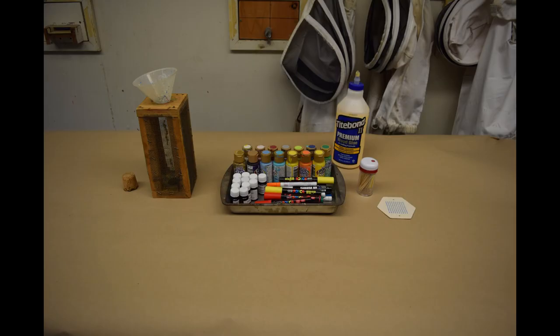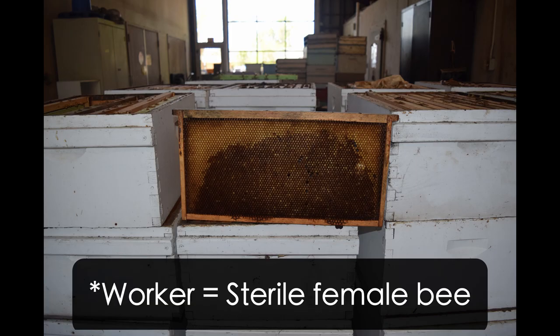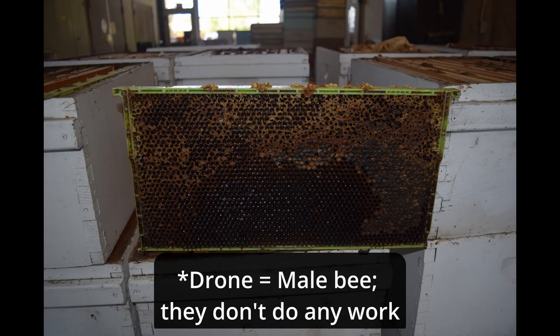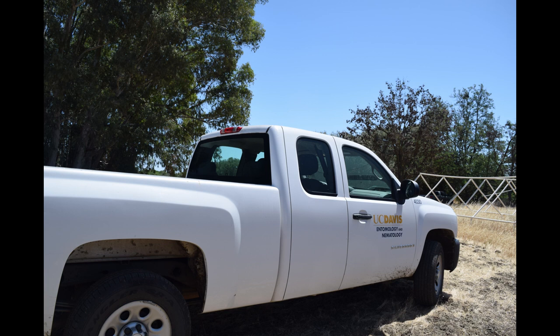The other supplies I needed for marking the next day were the actual paints, individual number tags, and cages to house bees after they've been marked. Luckily, all of that had been perfectly organized since I last left lab. Since part of this process involves taking frames from my colonies, I needed to make sure I was replacing those frames. I needed one regular frame to replace the female workers I took, and then a drone brood frame — where male bees are laid. Since male bees are a little bit larger, they get laid in a different type of cell, so you want to swap like for like frames.